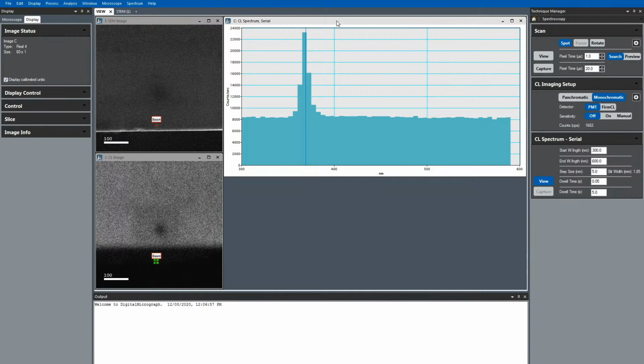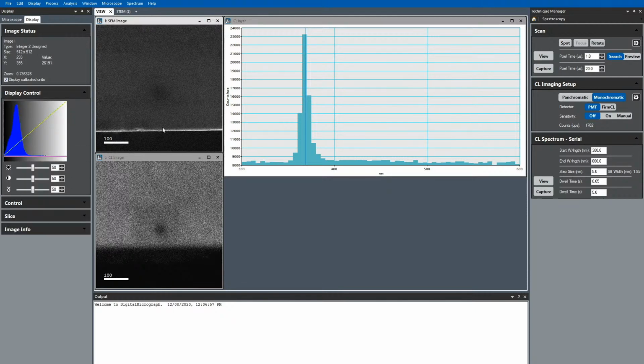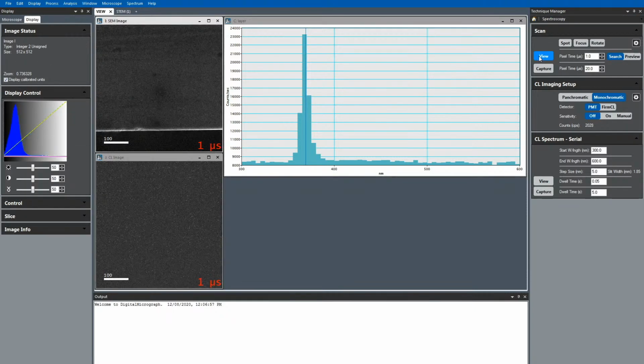Looks like not much is going to happen here. Okay, so we can save this, save as, we'll just call this one layer.txt. And now go out of spot mode. And we didn't really get any drifting, which is good.